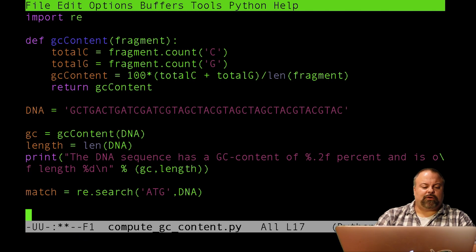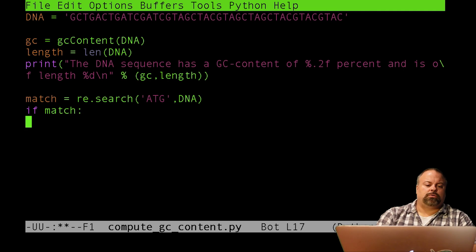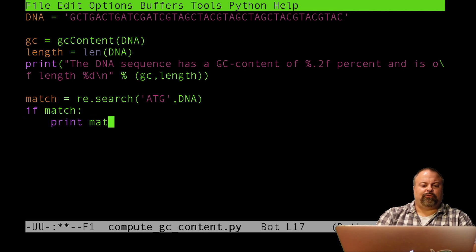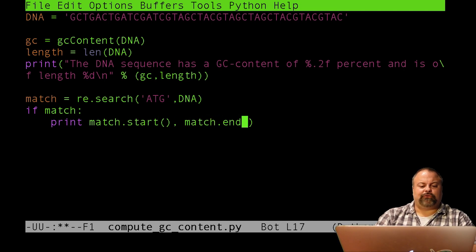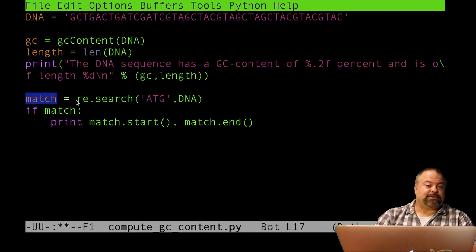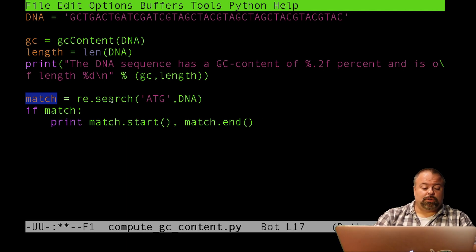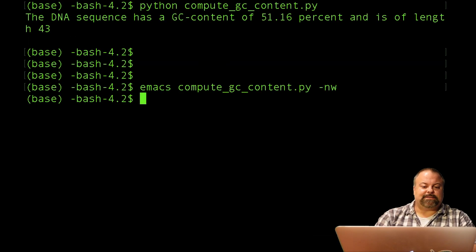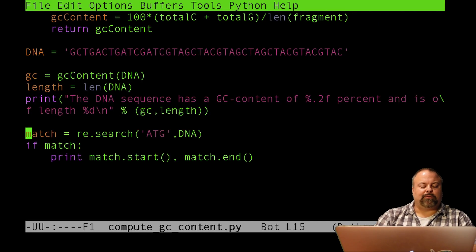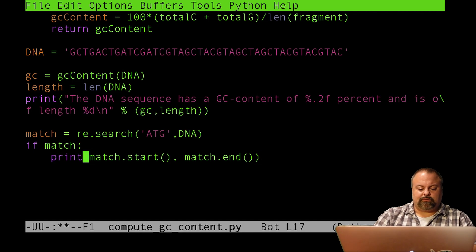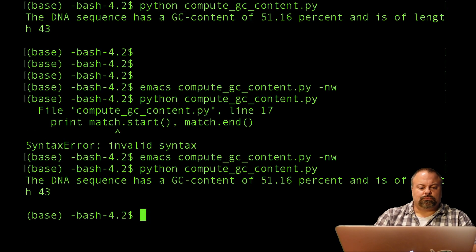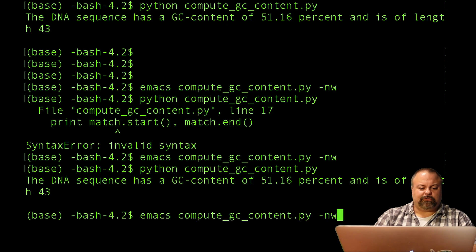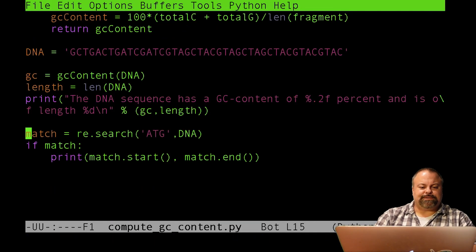So for example, I might start a search. And I might say re.search. And I might have that assigned to a variable called match. And say re.search. And my pattern, maybe my pattern is ATG. And my sequence is DNA. Then if I say if match print, and then I'm going to do match.start match.end. And so what I'm essentially showing you is that this particular special object returned by re.search is a special type of object. Let's call it a match object. And what it does is it basically defines the substring of that match.